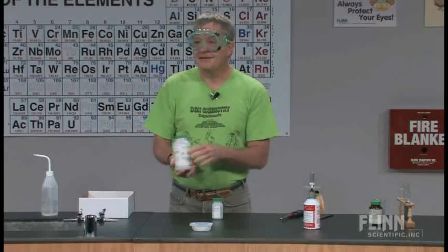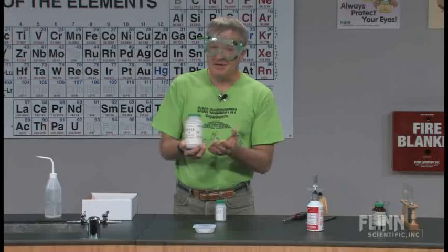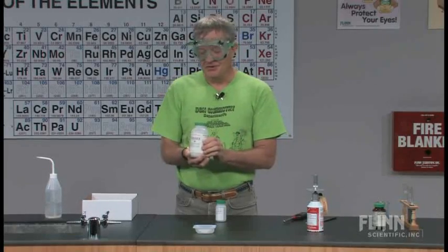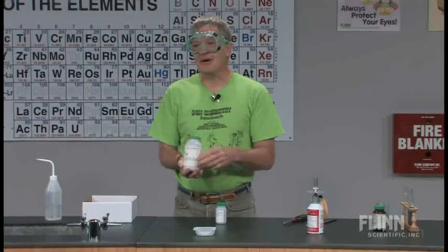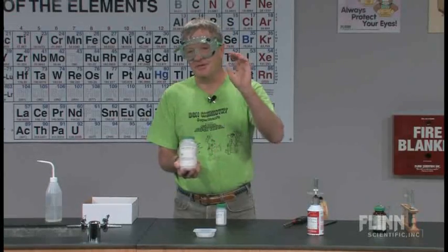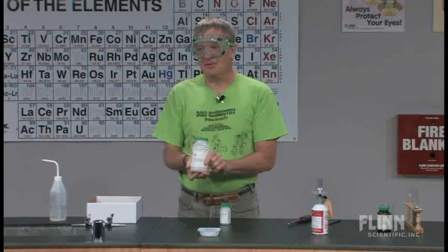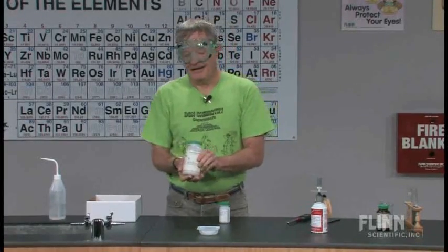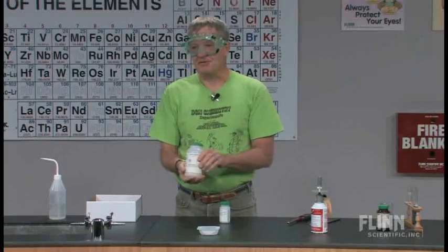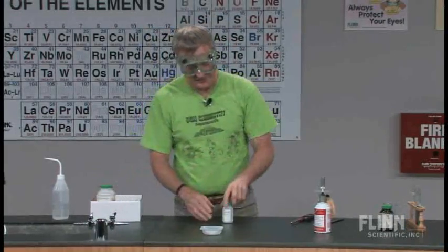One thing that's important with this, make sure it's dry sand. The reality is when I first started doing this demonstration, I just went out and grabbed some sand out of a sand pile in the backyard. Wet sand is a bit of a problem. And sand with a bunch of junk in it is a bit of a problem. And you'll see why once we run the reactions. But try to use a little bit purer stuff. It just has a real advantage.